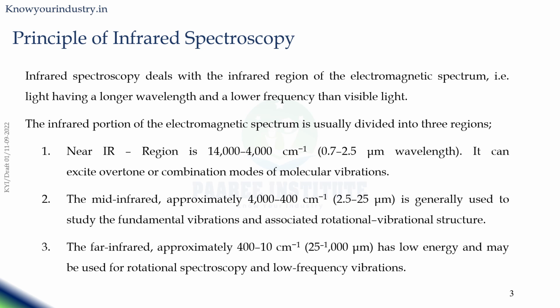Going back to the principles of infrared spectroscopy, as we have seen in the fundamentals and principles of spectroscopy in the earlier module, infrared spectroscopy deals with the infrared region of the electromagnetic spectrum, that is, light having a longer wavelength and a lower frequency than visible light.